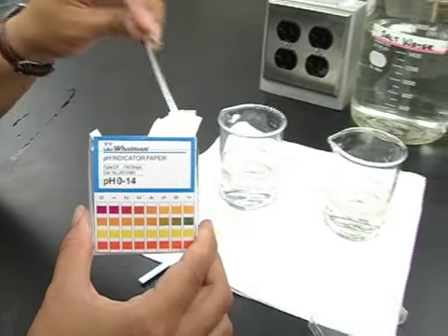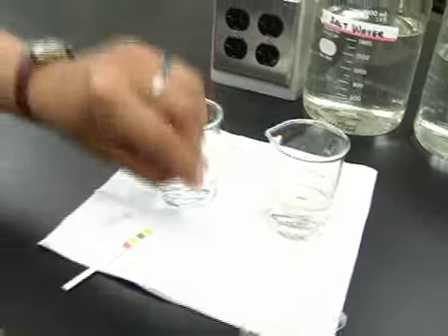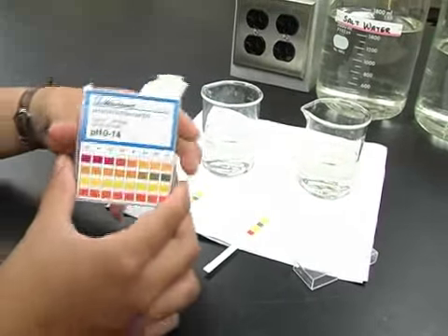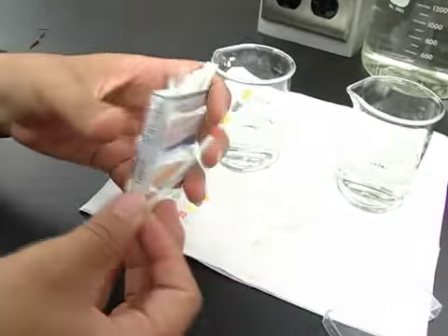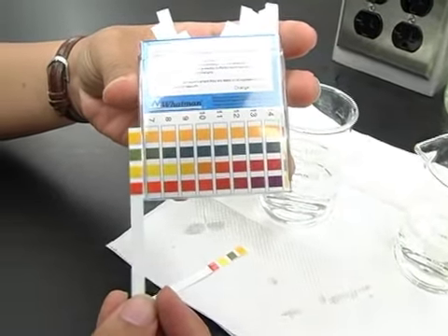To test for pH, use the pH indicator paper. Simply take one strip and dip the test area into the water sample. Remove and blot the excess water. Then, match the colors with the provided chart.